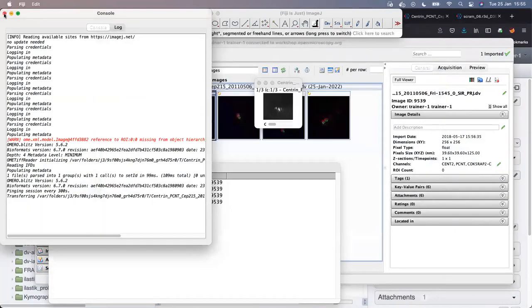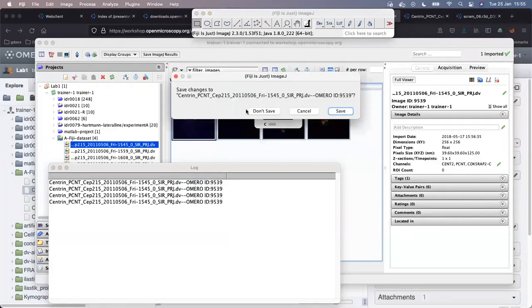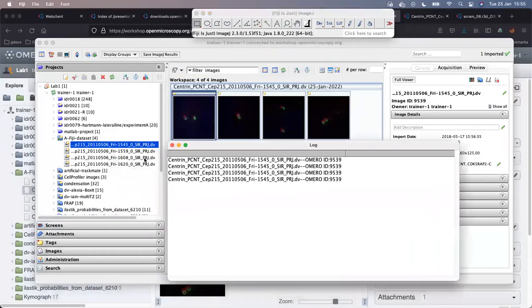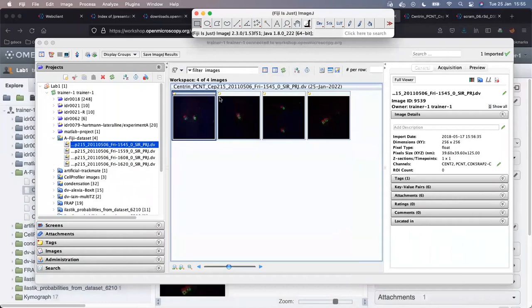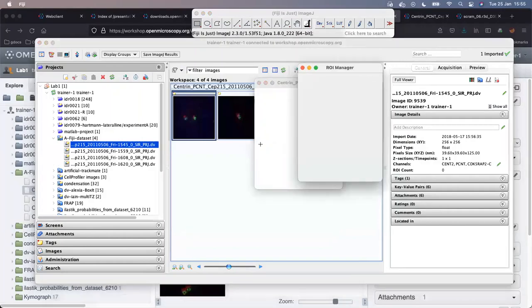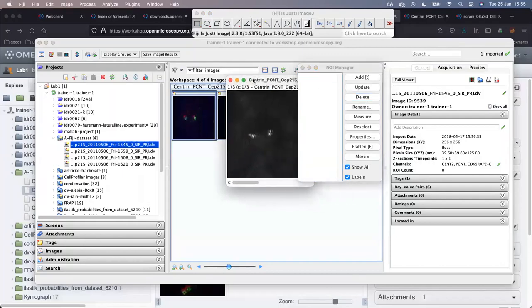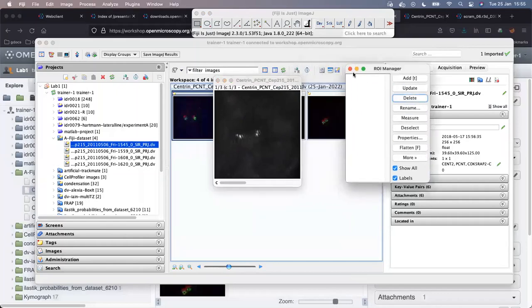So just to, let's say, give a motivation for the later work on OMERO Parade and OMERO.figure, I will do some more sensible analysis. Let me reopen the same image again, and this time, doing something more fancy.